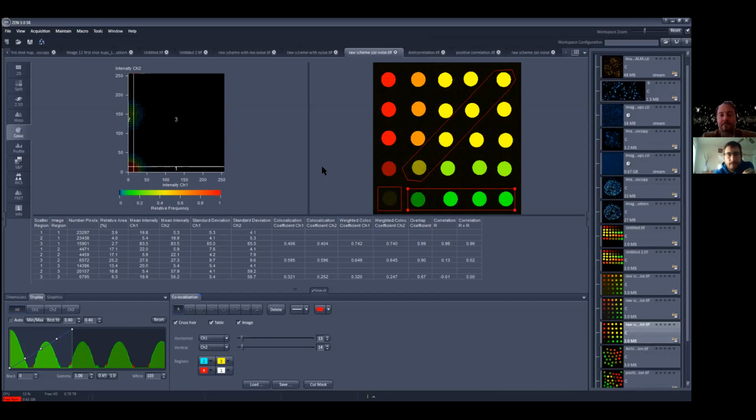It's pretty useful. Yeah, it can be used also outside of correlating green and red channels. It can be, like I said before, used to correlate anything. You take a static image and compare a moving image with it and say, okay, what are the objects that stay in common between the two images? They will show up as a pixel on the top on quadrant 3, whereas things that move, they will not be in successive frames. They will be in either channel 1 or channel 2.